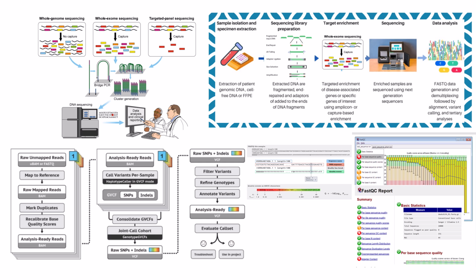QUAL, the overall quality score assigned by the variant caller. SOR, a measure of strand bias. FS, another measure of strand bias, Fisher strand. MQ, mapping quality of the reads supporting the variant. DP, the total read depth at the site. And rank-sum tests like MQRankSum and ReadPosRankSum that look for biases in where the variant appears within the reads.